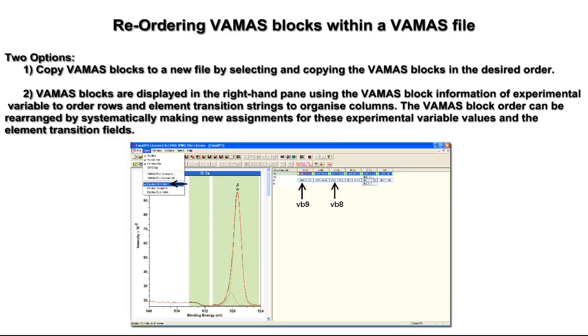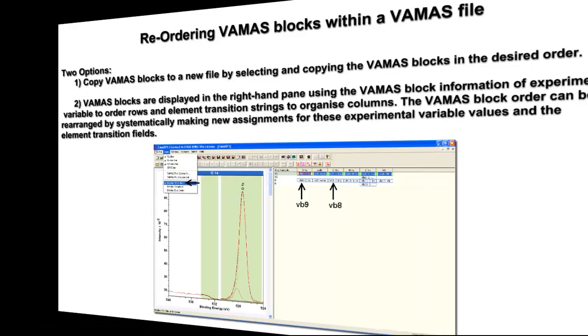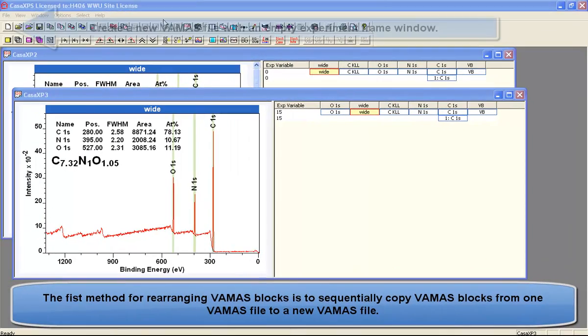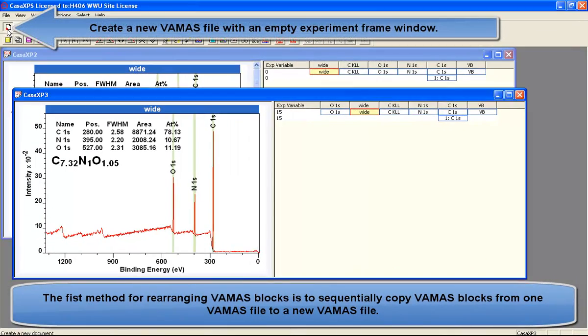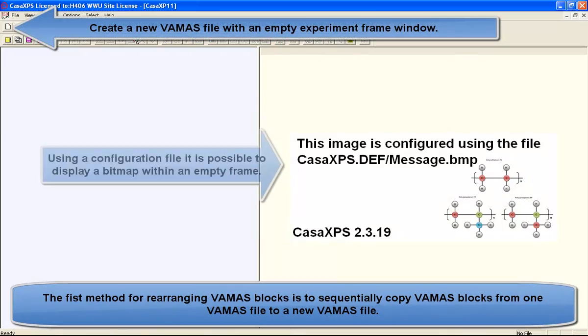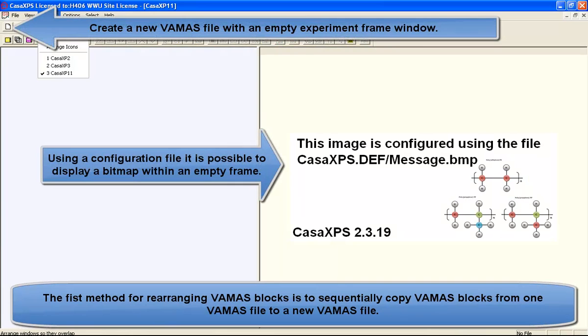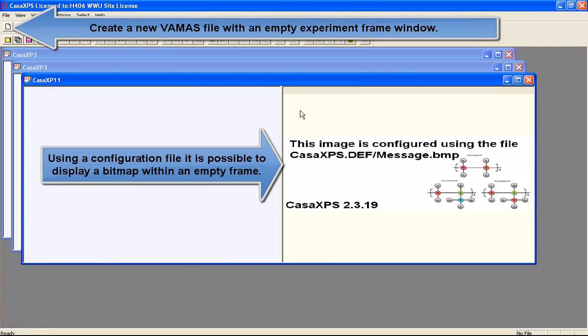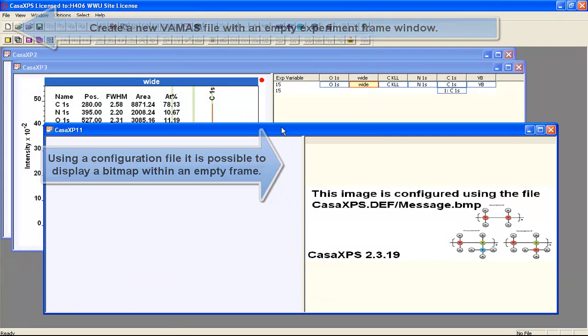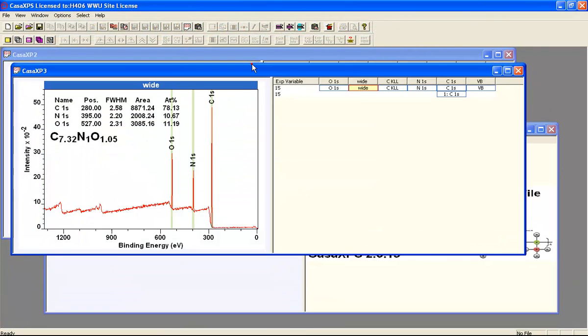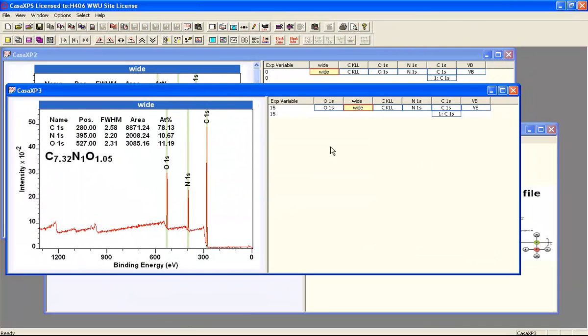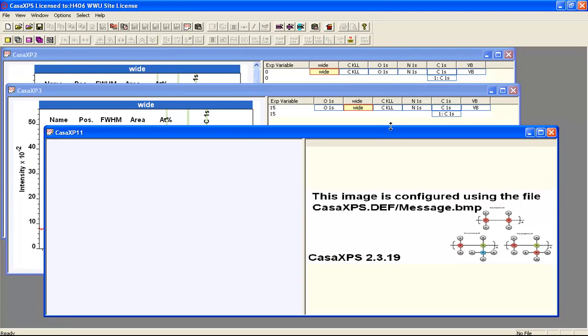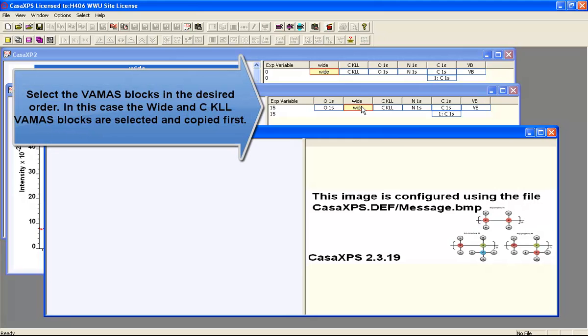A VAMAS file contains a set of VAMAS blocks which contain either spectra or images. The order that these VAMAS blocks appear in the right-hand pane of CASA XPS is determined by the element transition field, the experimental variable, and the order for the VAMAS blocks within the data file.